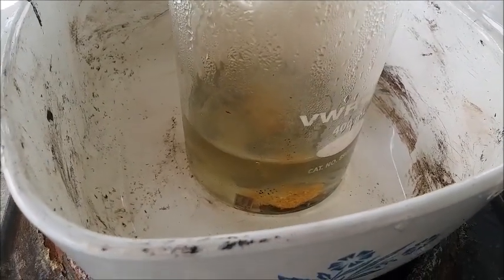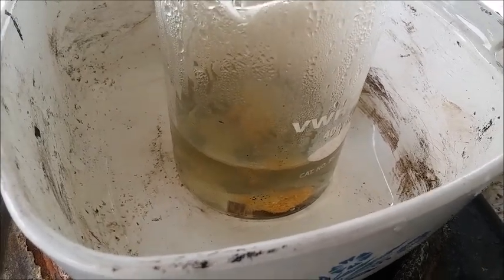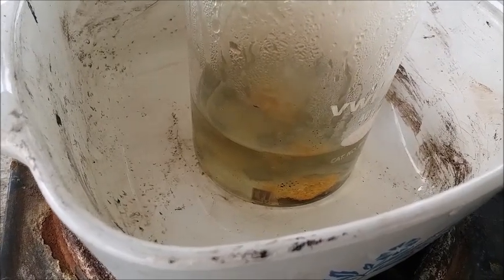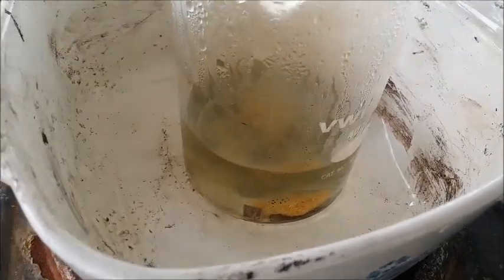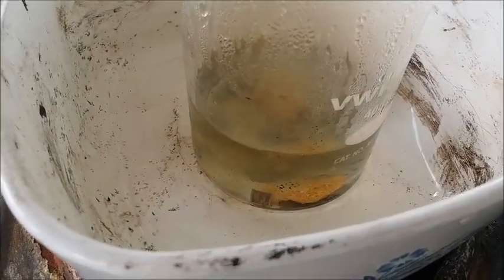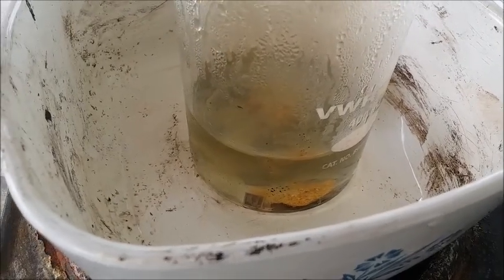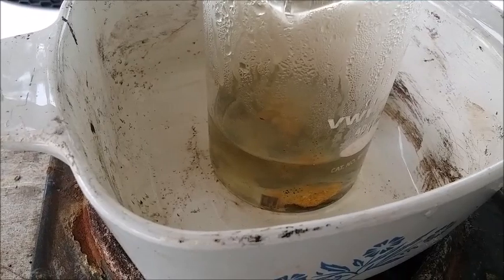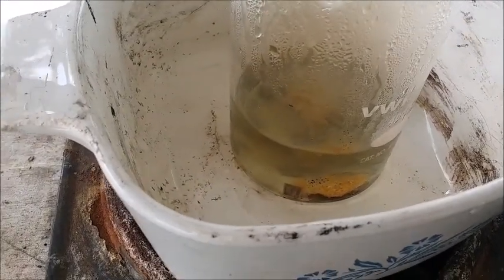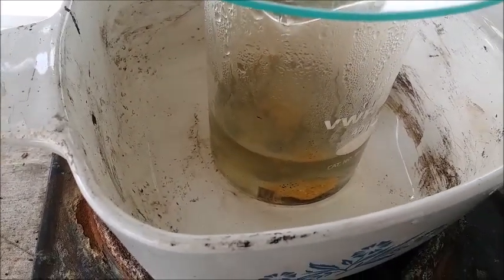So I think a lot of that bubbling is actually boiling more than an actual reaction, but I have seen some stuff that looks like reaction going on, and there's definitely brown fumes and the liquid's turning blue. So there's some copper in there, maybe some other base metals that are getting consumed by the nitric acid. So it's working good. I'm gonna let that go for a while till it looks like the reaction's done. Decant off the liquid, rinse it, and then it'll be time for aqua regia.